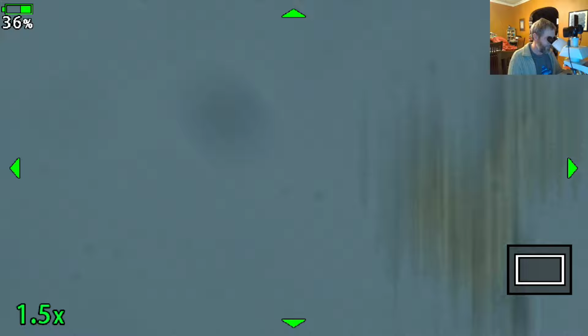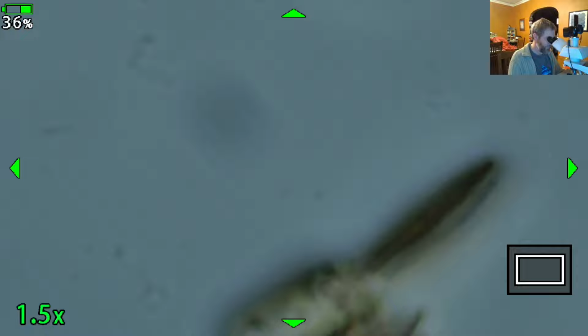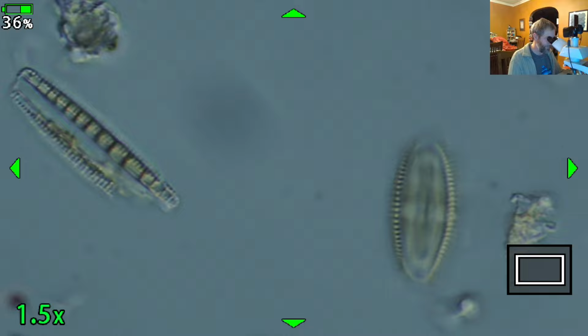Somewhere in this stack of things, there's another one of those Grunowia. A bunch of these Grunowia, actually. They're all over the place in the slide. Here's something we haven't seen before tonight. We've seen it before on streams.